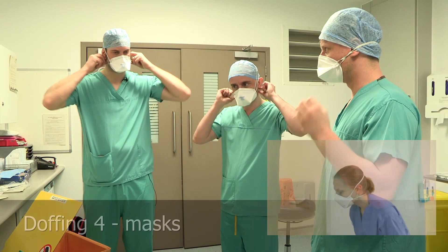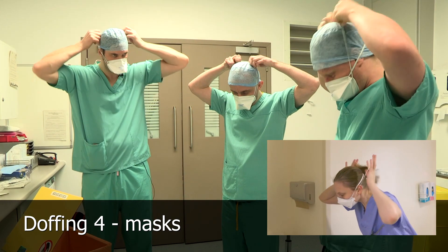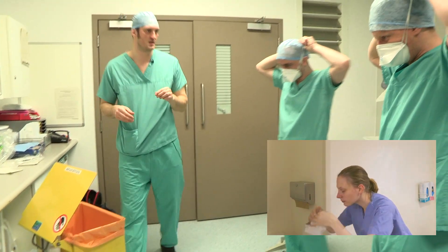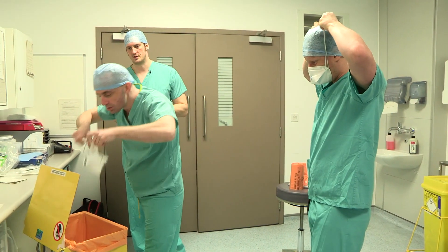With the FFP3s, take the nape of the neck strap and bring it up to the other strap. With both straps together, lean over the bin, bring the strap over your head and let the mask just drop so you never touch the front of the mask. Just lean forward and let it drop.